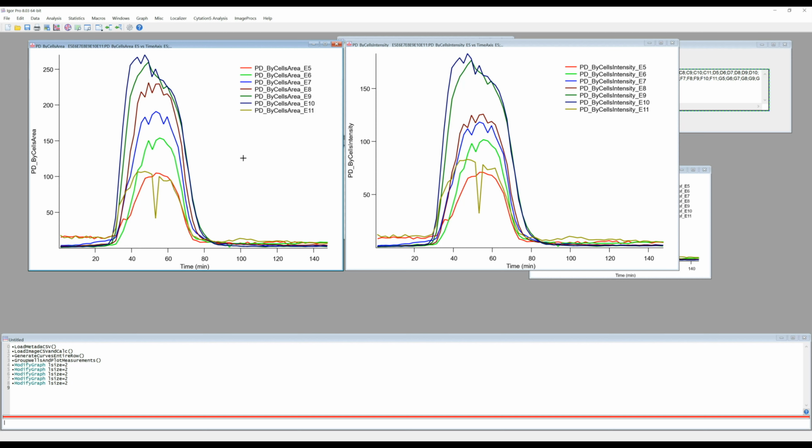Even if you grab a little bit larger area that includes the background, that may not cause any difference for... oh no, that will cause difference for the area, but it will not cause much difference when you calculate the intensity, because background will be very low. So these two have a little bit different responses to imperfections in segmentation and in deviations in focus.